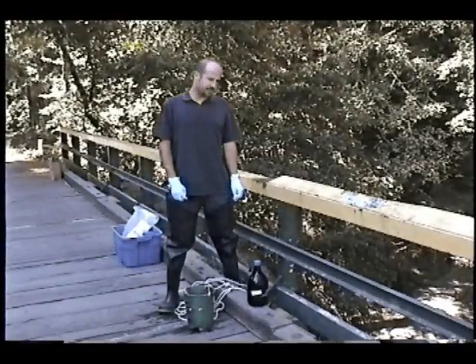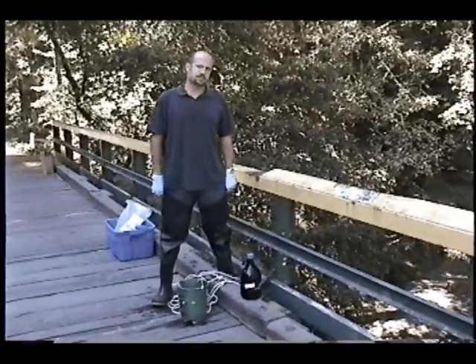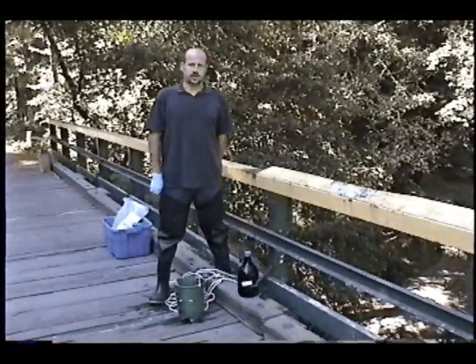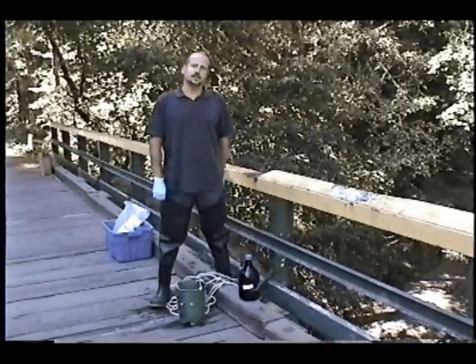This is a demonstration of a bucket sampler. Oftentimes there's limited access to the sampling reach where you want to sample, and there are bridges or hydro modifications where you can actually lower the bucket sampler off of to get a water sample.